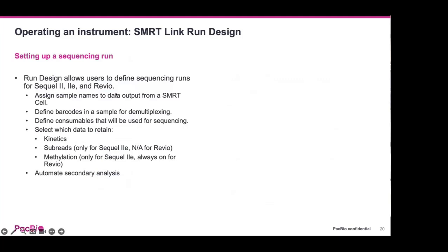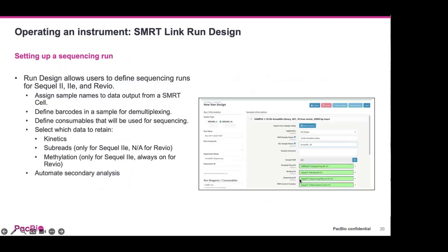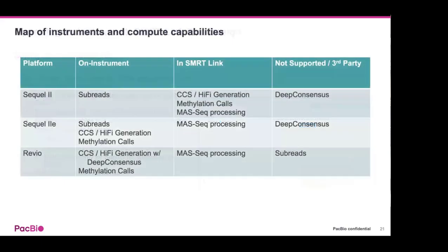Once that's done, you create your SMRT Bells, and you can set up a sequencing run. There are different run setup UIs depending on the different instruments. There's more technical training you can probably watch for more information on this.